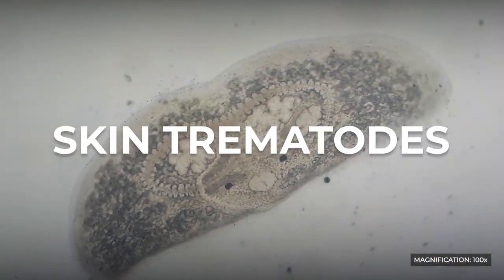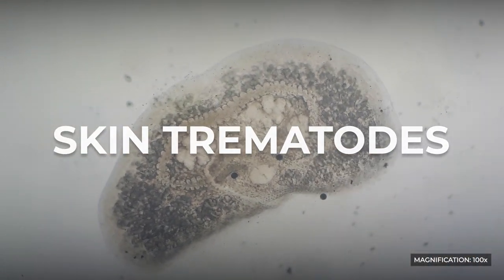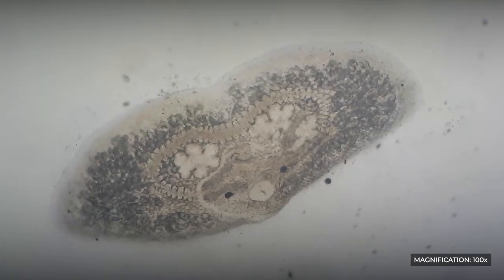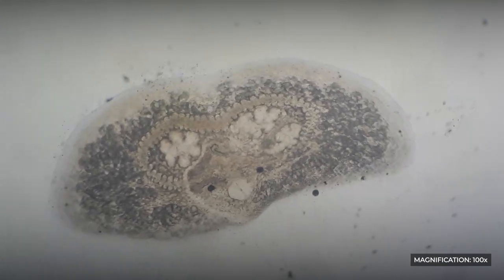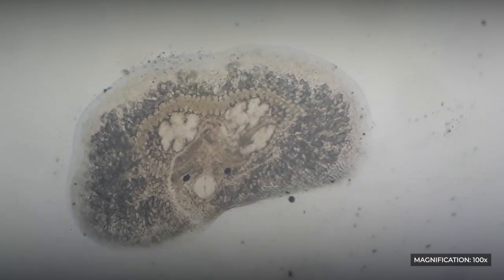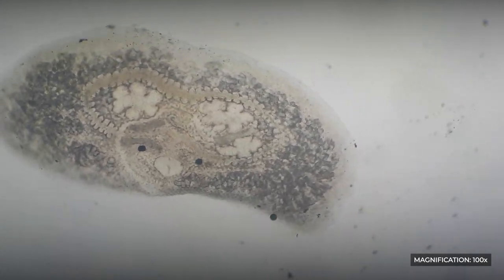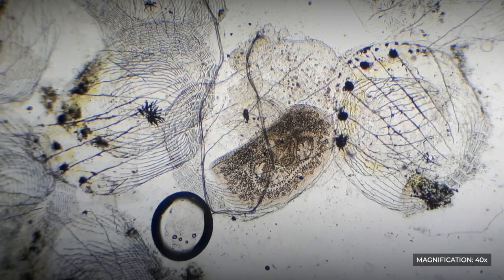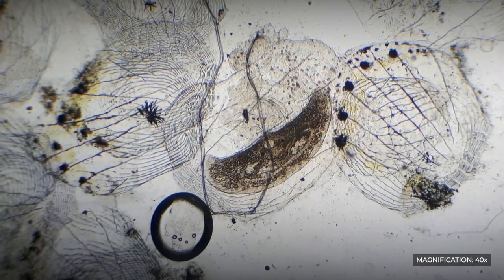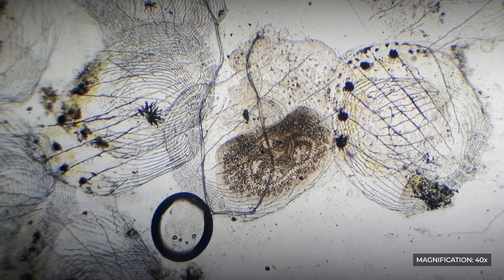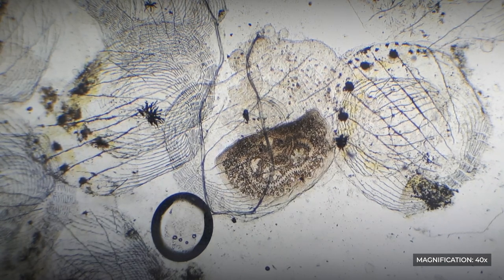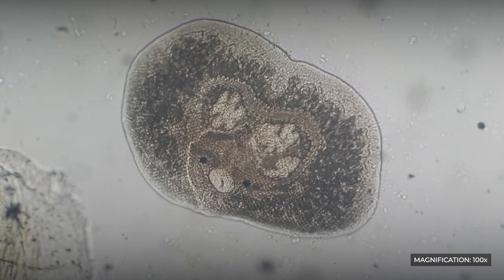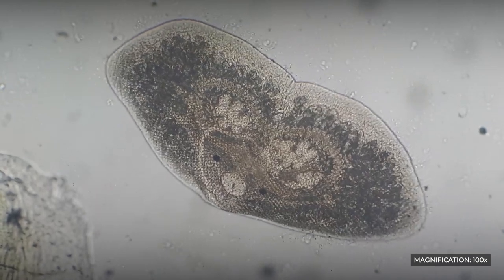Skin Trematode: Flatworms of the genus Transversotremor primarily parasitize marine fish species, although there are also species that affect freshwater fish. They are not commonly found in scrapings from the skin of fish. But if you come across a similar butterfly-like worm with a patterned design, you will recognize it as this parasite.